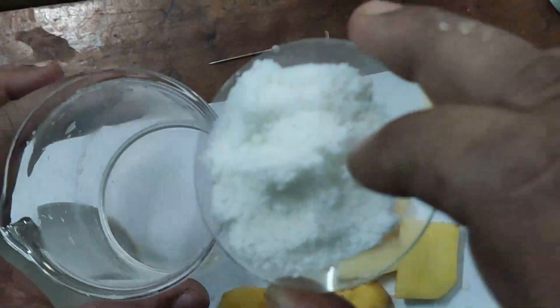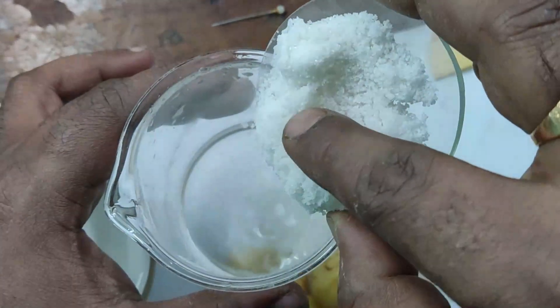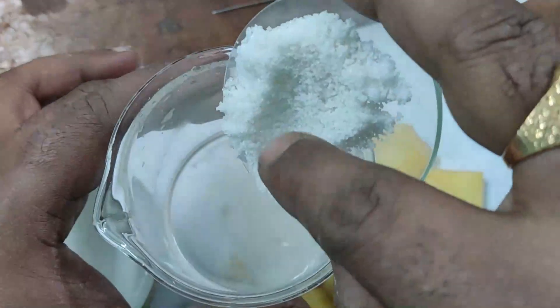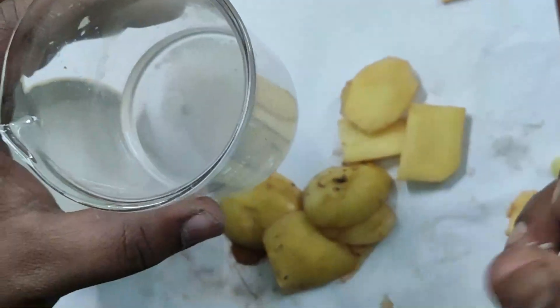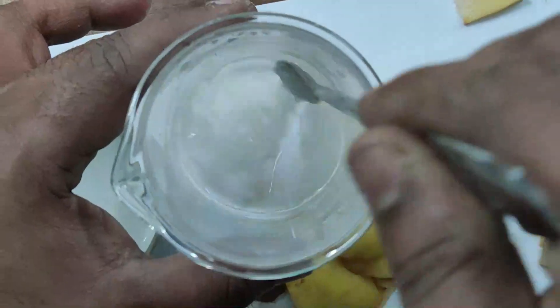Then we will prepare our salt solution by adding salt into the water and mixing well with the help of a spatula.